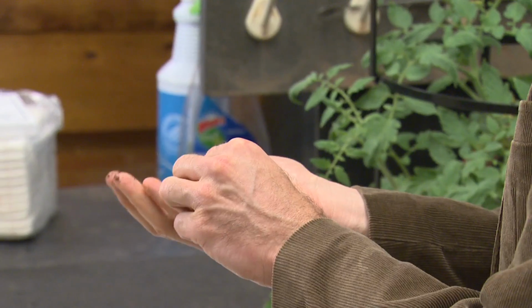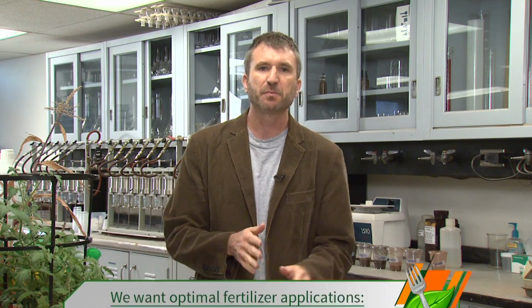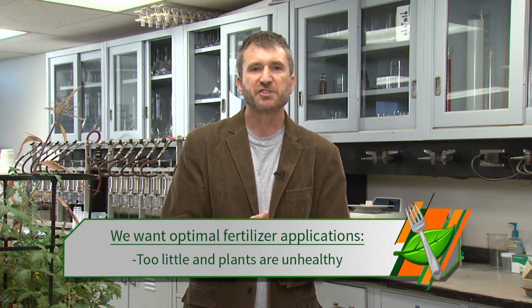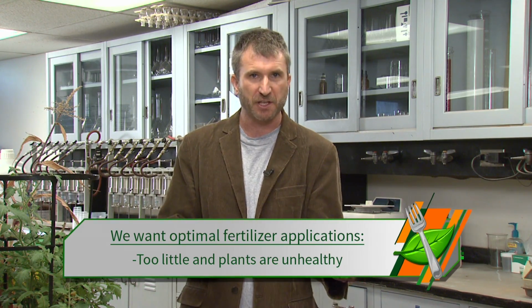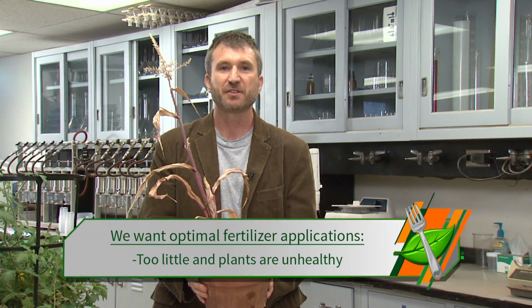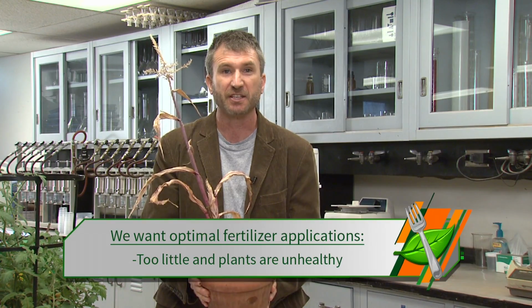That first step of gathering a sample of soil from a field and sending it to a lab to be analyzed to determine its nutrient content. Now this is an important question not just for farmers, but for everybody. Because if we apply too little fertilizer to a field, we get corn that looks like this, which means less food for us to eat.